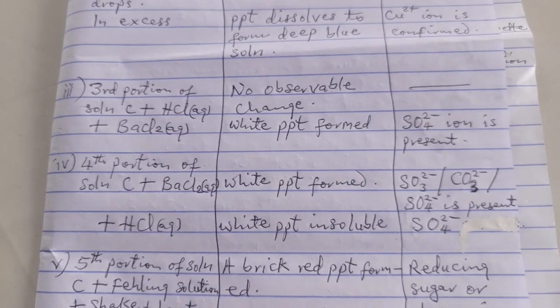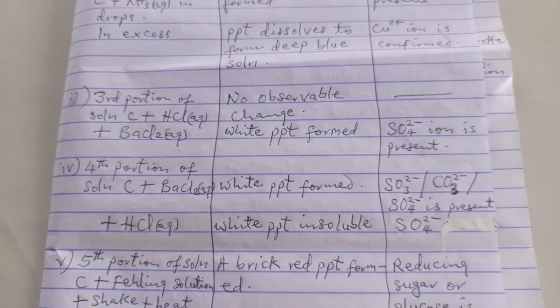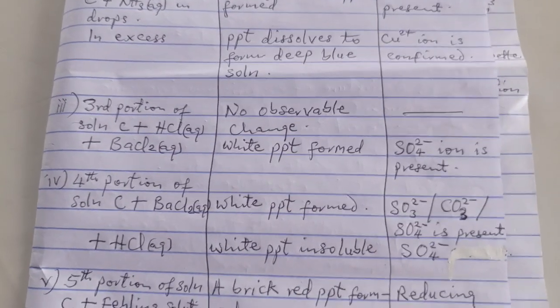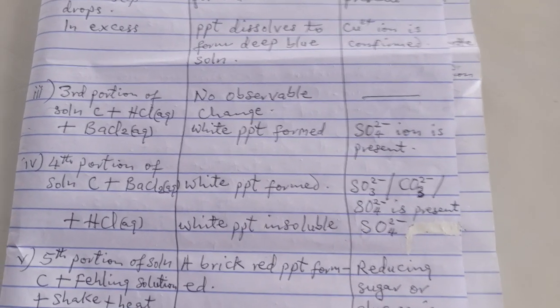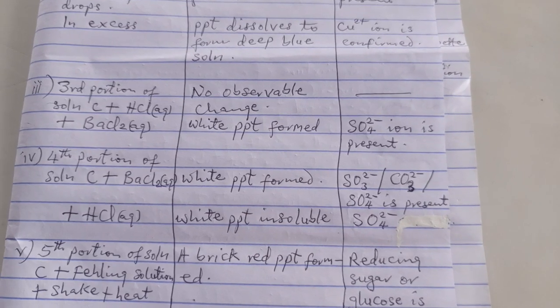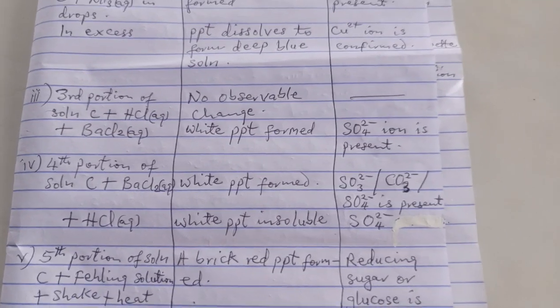Now the fourth portion, we now start with barium chloride, because we don't know which one will come. Just know all. Barium chloride. Then when you add barium chloride to it, you have a white PPT formed. When you start directly with barium chloride, you should know that more than tetraoxosulfate 6 ion is expected.